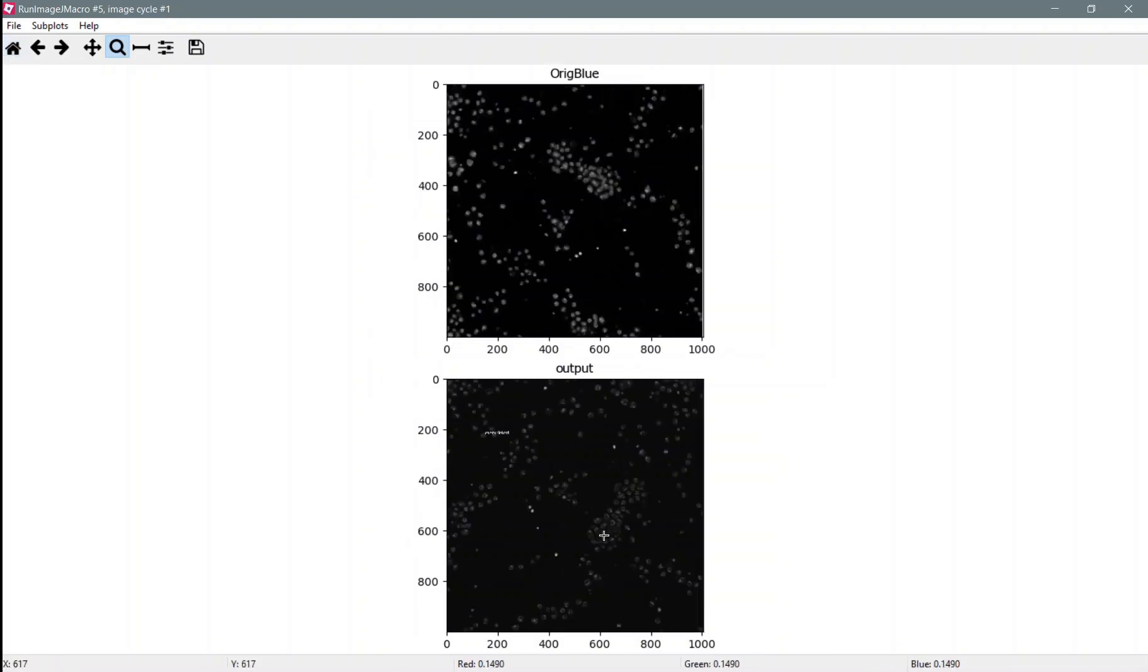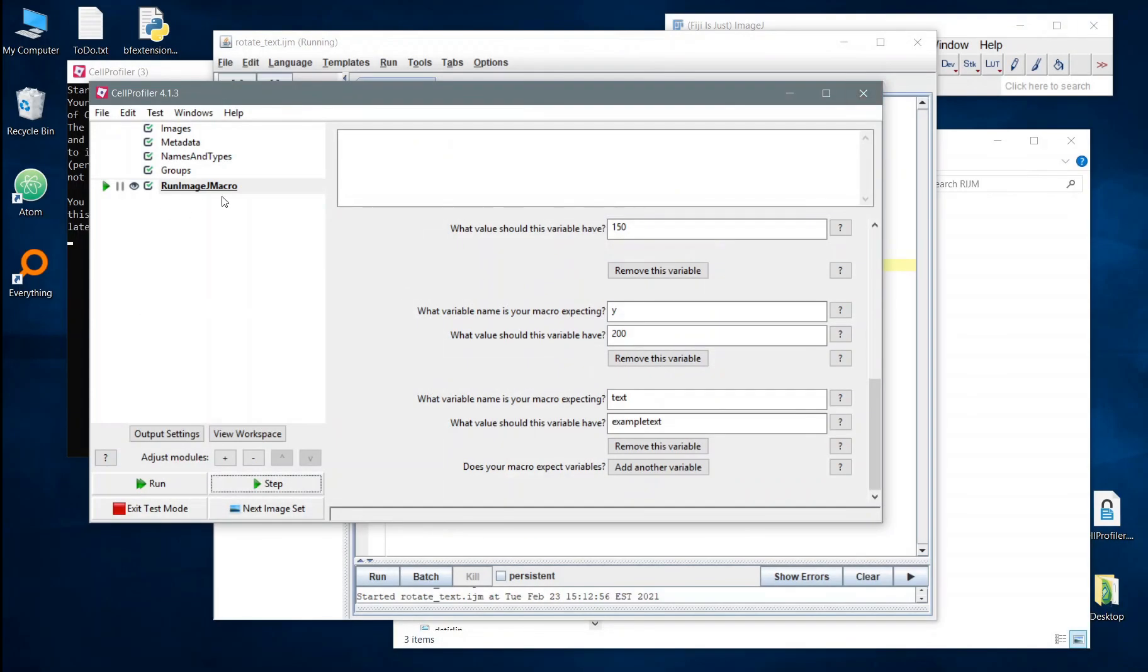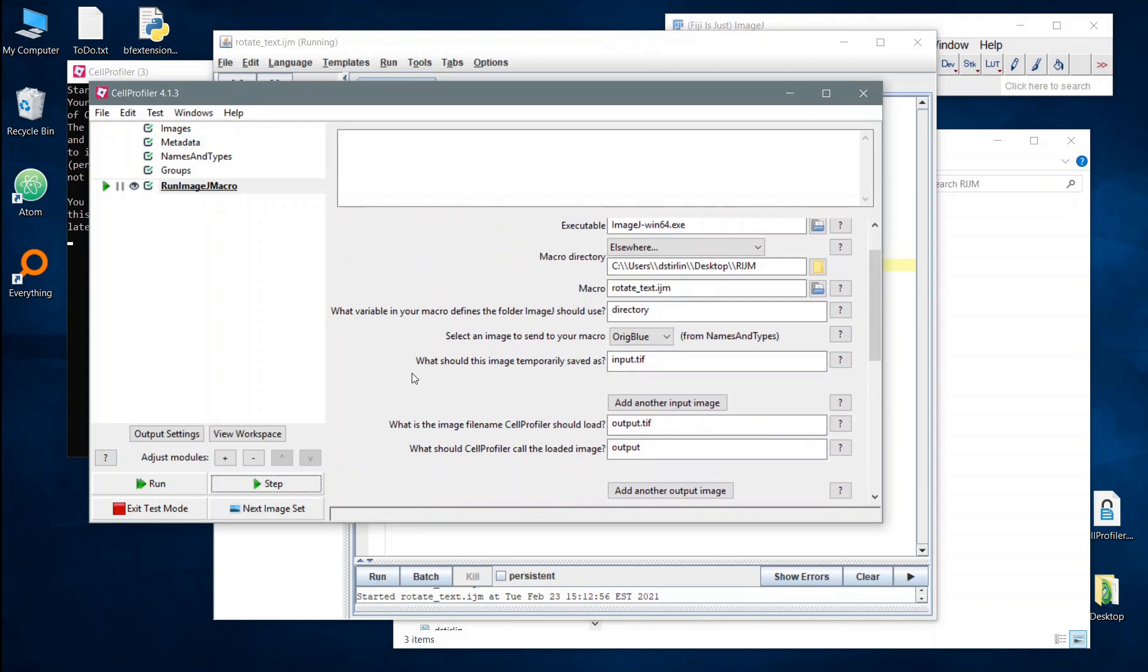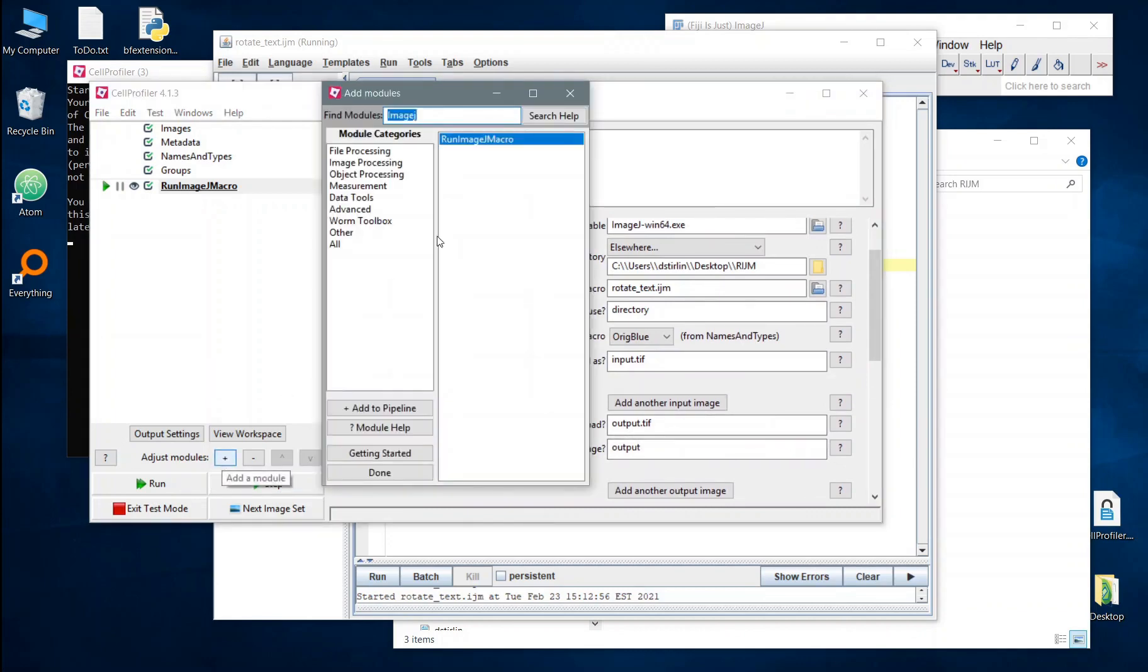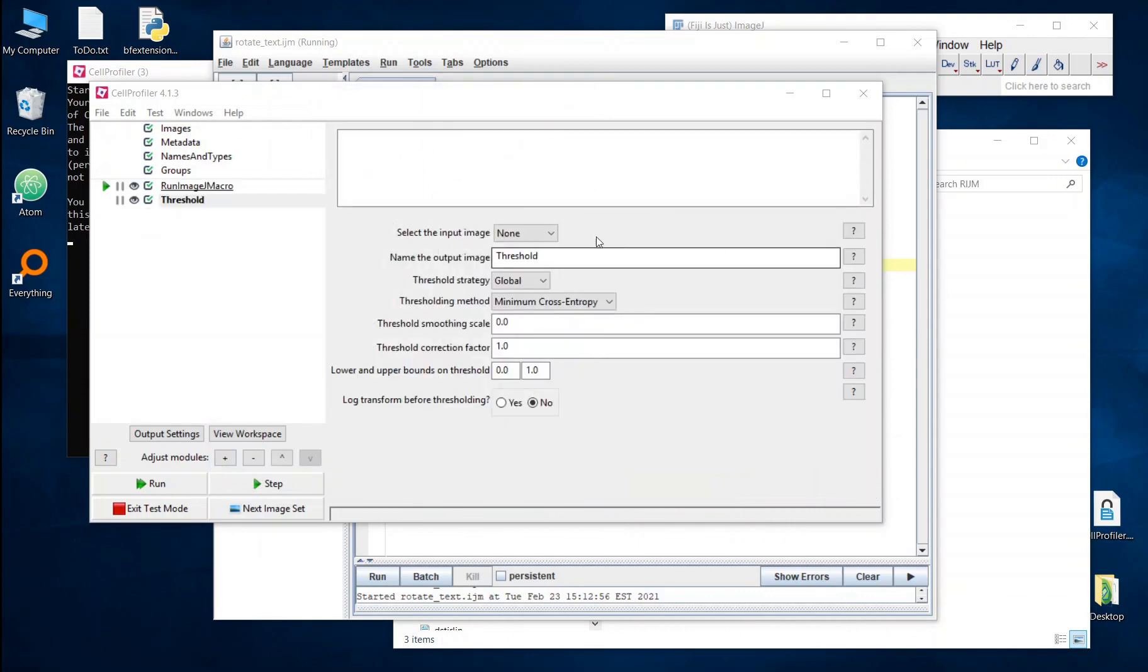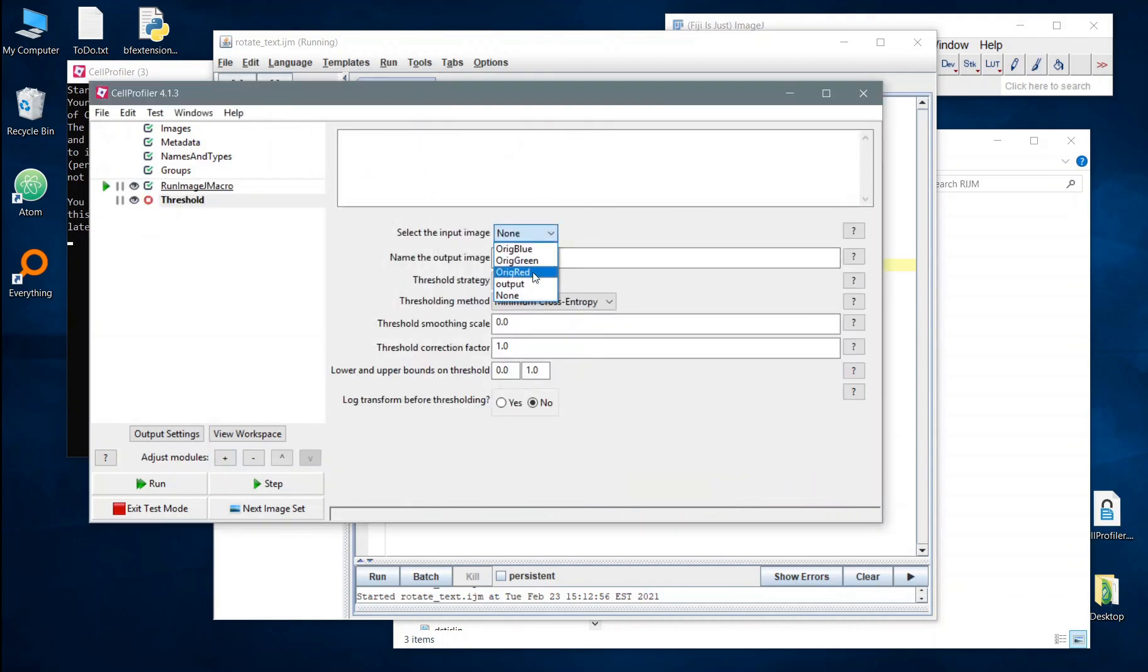Now that's not particularly useful for most CellProfiler cases, but where this could be useful in supplying a variable is if, say, you wanted to change the size of a filter or the intensity of a particular transformation. So the images produced by this particular module can then be used in anything downstream. So if we wanted to use the threshold module, you'll see we've now got that output that we produced in the run ImageJ macro module.